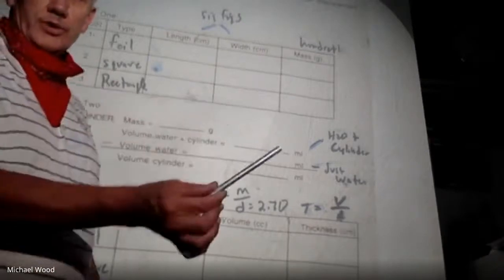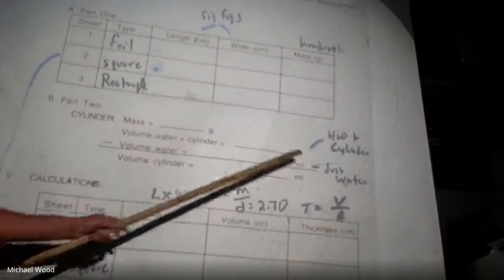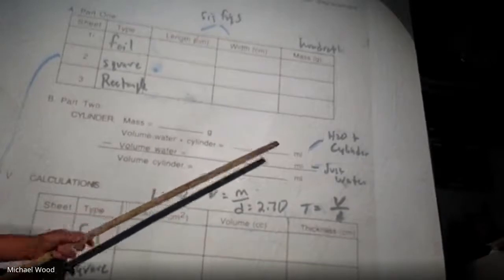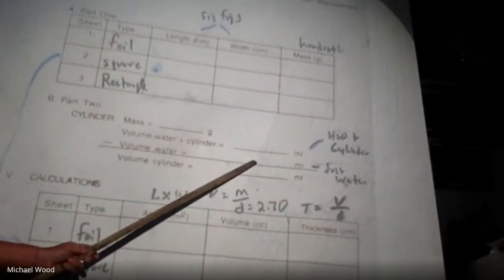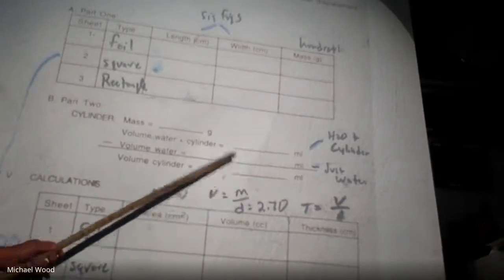Okay, and then here, this is where we're going to do the cylinder. So you're going to weigh it again on the balance, and then this is the volume of the water in the cylinder. So this is just the water. This is when you add the cylinder to the water. So really you're going to get this reading first, and then you're going to come back and get this one. And then to find the volume of the cylinder, this is water displacement, so you'll just subtract those.